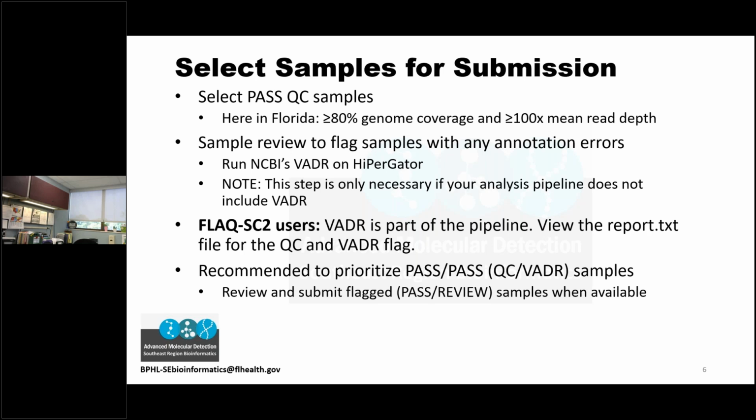We might lower ours here in Florida and submit more, because data that is a complete genome will be used for some purposes, but other data, if it's not a complete genome but still has complete genes or CDS regions, is useful for other purposes too, especially if you have a full spike gene. So it's still recommended to submit those samples.